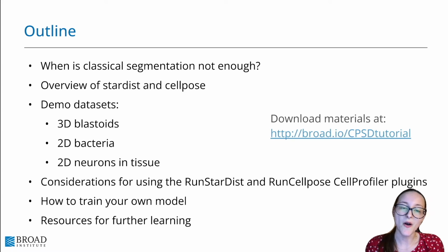I should mention that all of the materials that are used today, so the images as well as the pipelines, are available for you to download at this short link, broad.io/cpsd tutorial. So you can download the images and the pipelines there and see a little bit more about how to use these plugins in your own data.